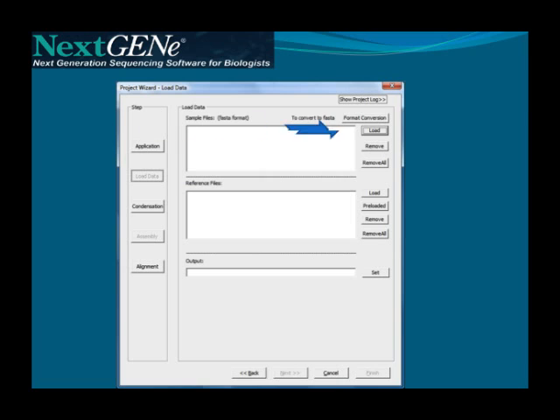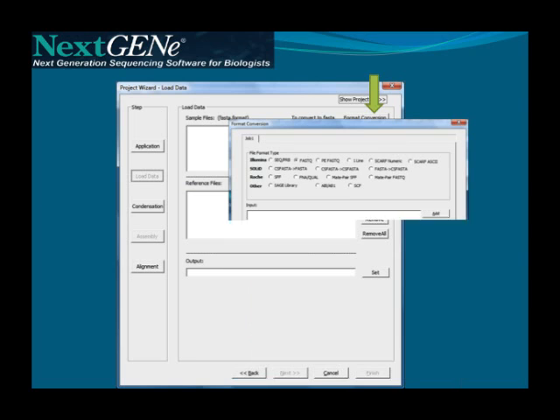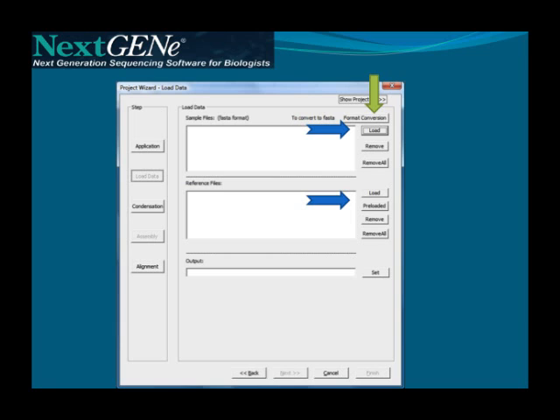On the Load Data page, you can click Load to load your sample files in FASTA format. If your files aren't in FASTA format, you can open the Format Conversion Tool to quickly convert and quality filter the data. Next, the reference file is loaded. To align to a small reference, less than 250 megabases, you can load any FASTA or GBK file. For larger references, like the human genome, indexed reference files are required. If working with a large genome, contact SoftGenetics to receive the indexed and fully annotated reference.